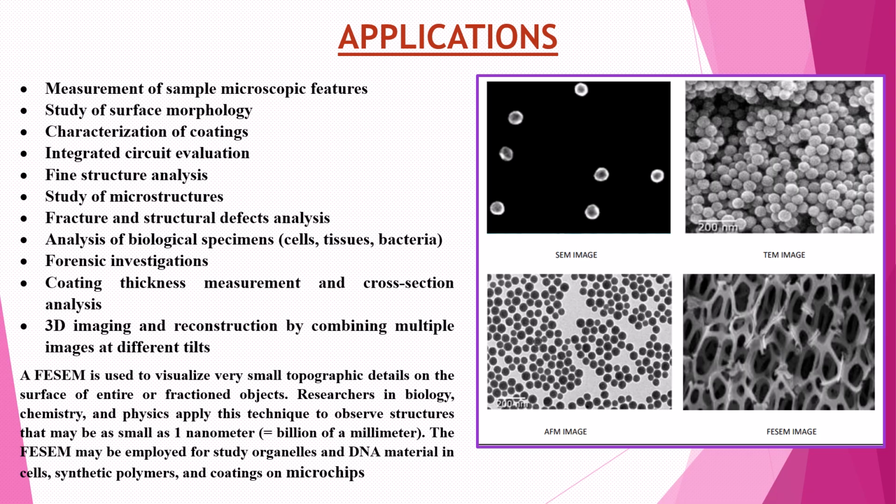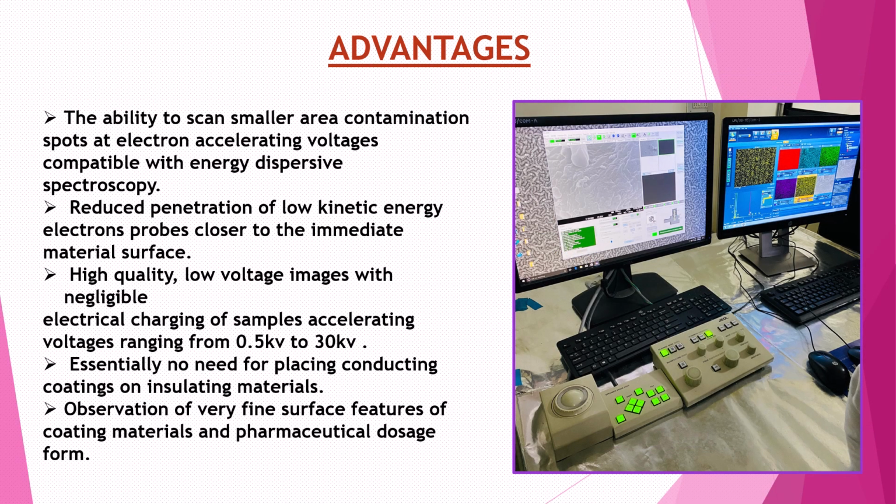FESEM is used to visualize very small topographic details on the surface of an entire or fractional object. It also tells that FESEM may be employed to study organelles and DNA material in cells, synthetic polymers, coating, and microchips also. So there are some advantages.